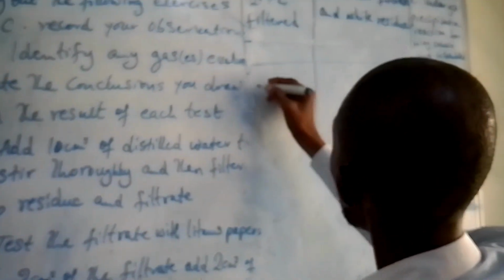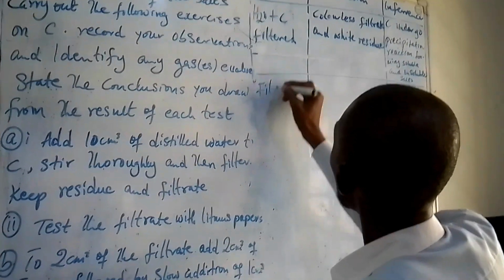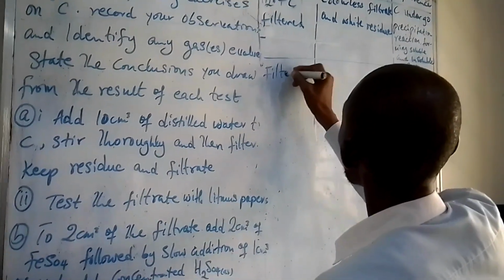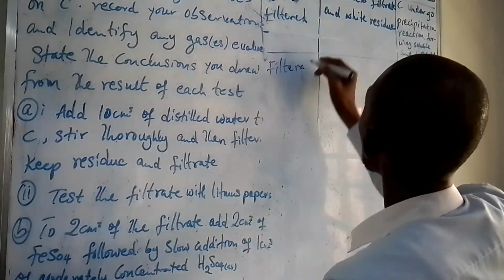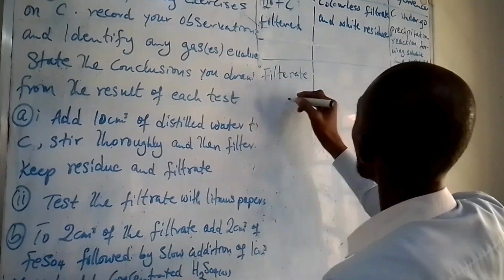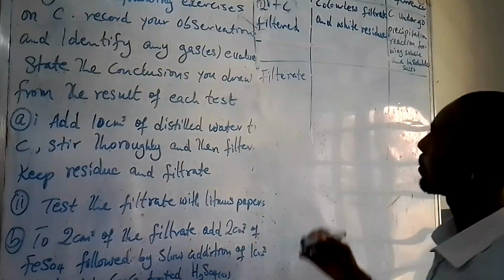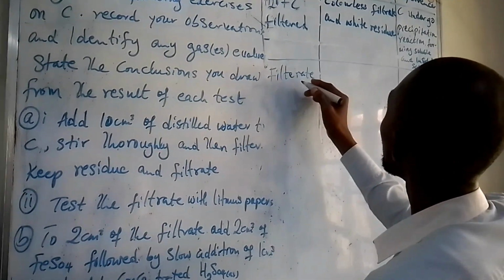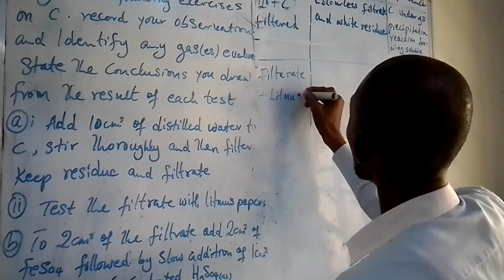The first test is filtrate plus litmus paper.